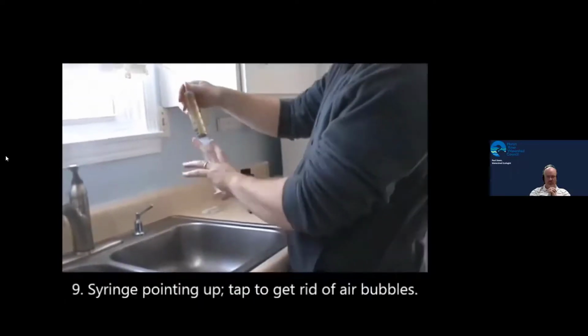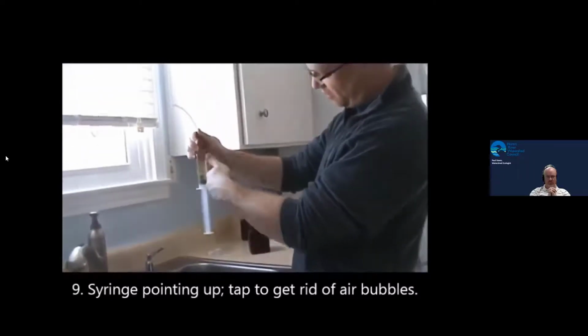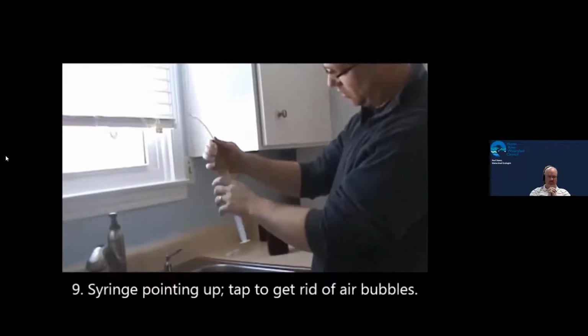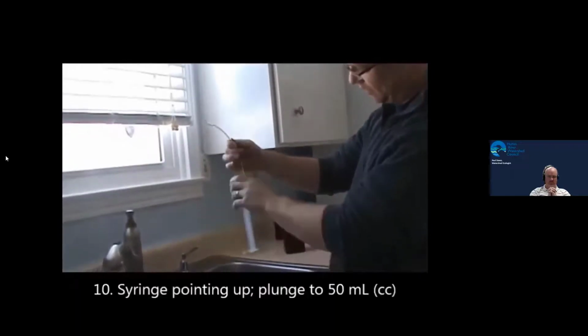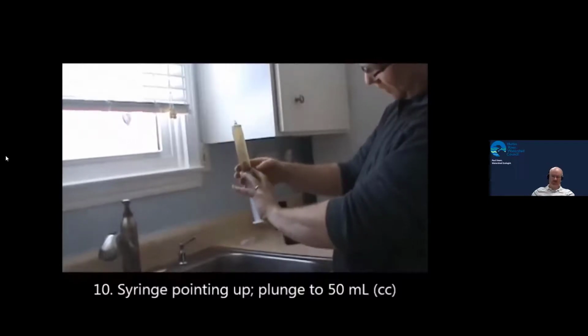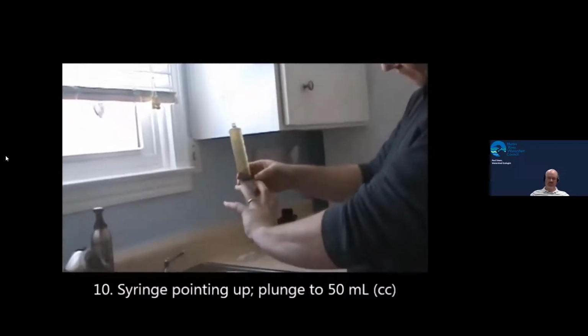With the syringe pointing up, tap it to force air bubbles to the top. Push the syringe plunger until the end of the plunger is lined up with the 50 milliliter mark.